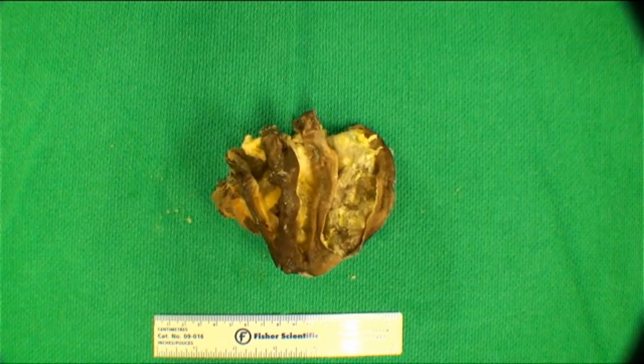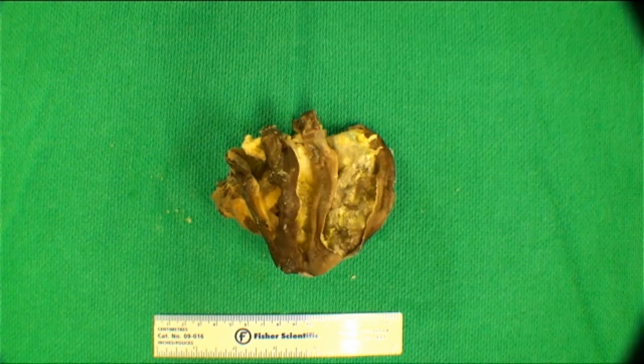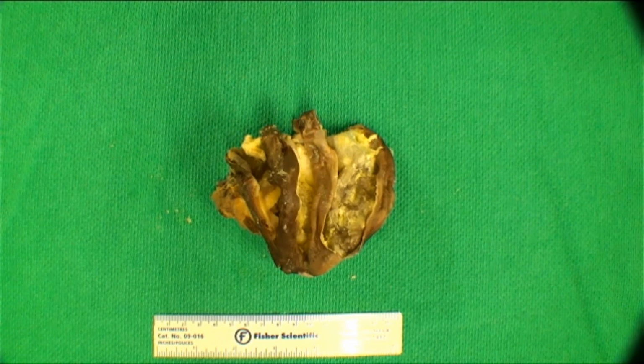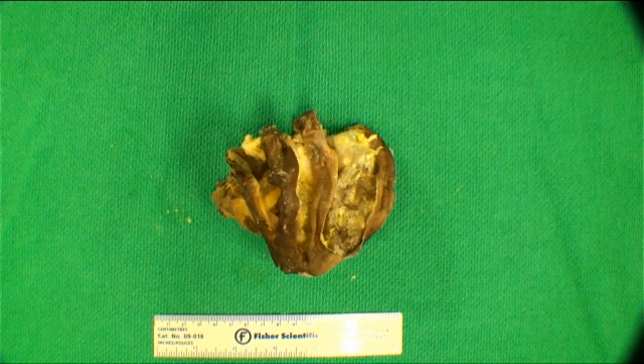Okay, so hold on. I think I've got another question regarding this. Let me just put it up. What are the 3 different types of teratomas? Let's put it up in the chat. Yep, mature, immature, and monodermal. Thank you. So this specimen here is considered mature.